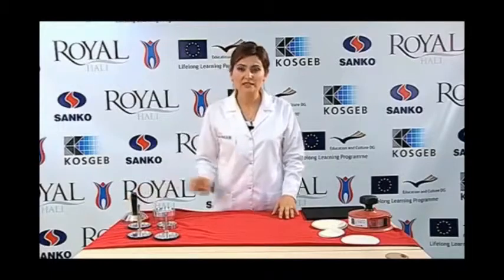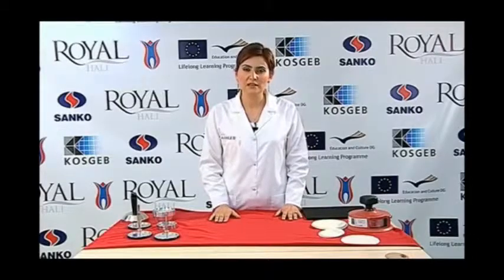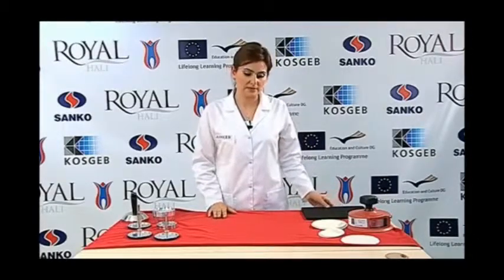Before preparing the test specimen, we condition it under standard atmospheric conditions for 24 hours. The conditioned specimen is subjected to washing and dry cleaning pre-process upon customer's request. The washing or dry cleaning process is not done if the customer does not demand it. The pre-treated sample is reconditioned for 24 hours and the sample is prepared.